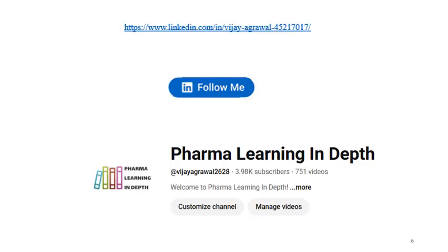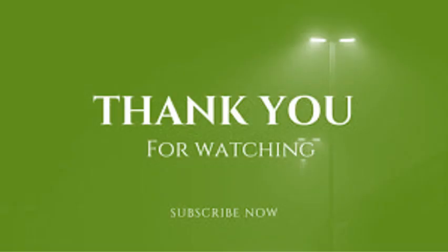So this video is related to some terms related to the particle size and particle size distribution. Whenever you are going to use the APIs in your formulation, or you are starting to use, you should always have particle size data and you should relate the CQAs of the drug product to the particle size.